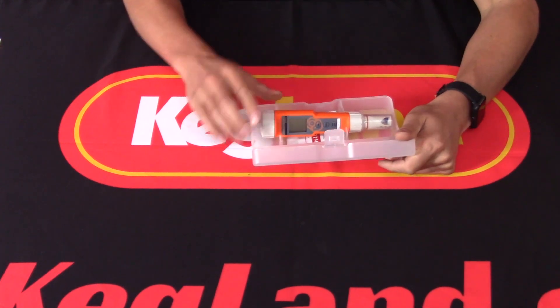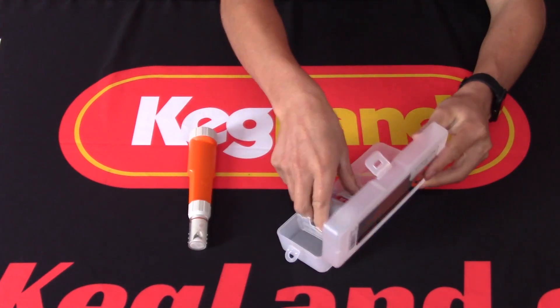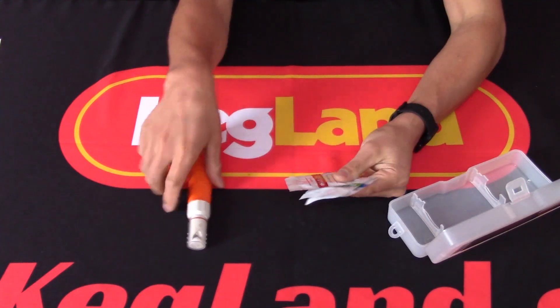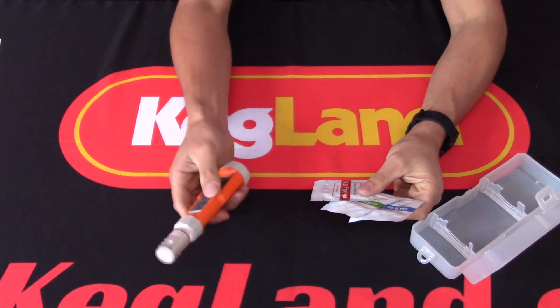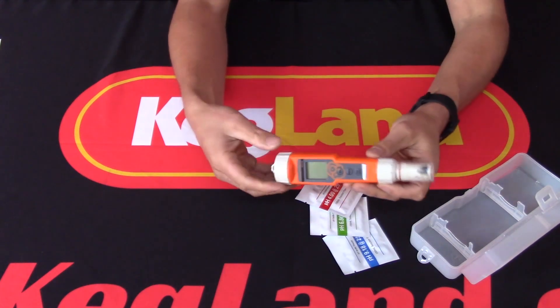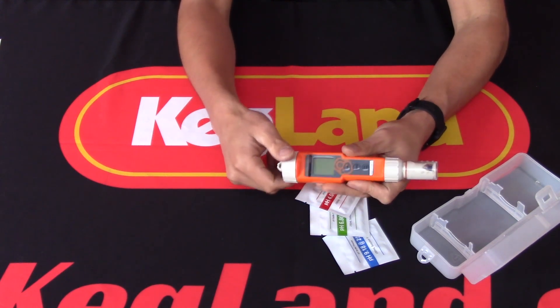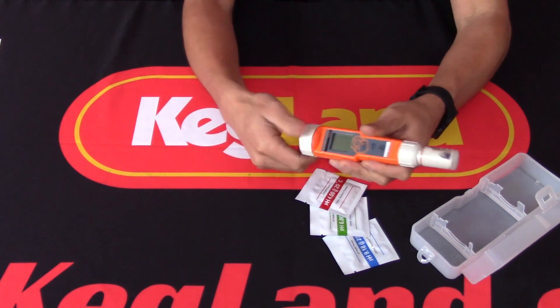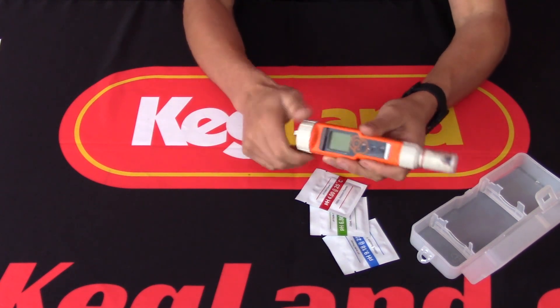The pH meter comes in a nice little polypropylene box with batteries inside and also three buffer solutions, because this particular pH meter has three-point calibration. The pH meter has been built with an IP67 rating, which means it's fairly water resistant — you can splash water all over it and it shouldn't be a problem, which is fairly important for a brewer.